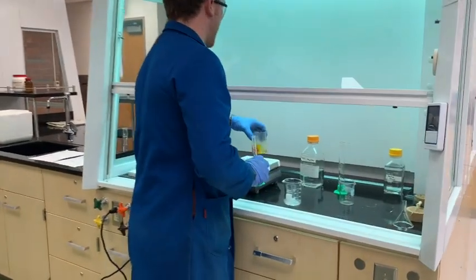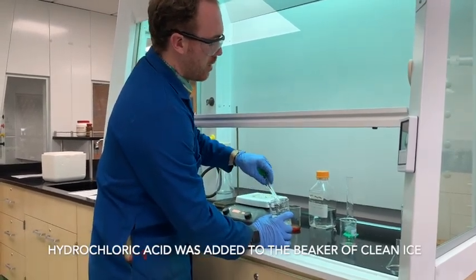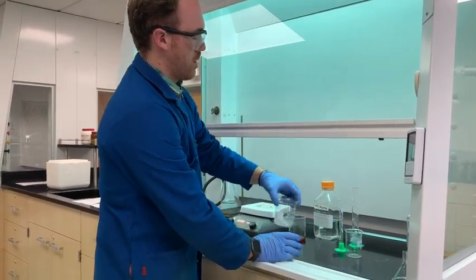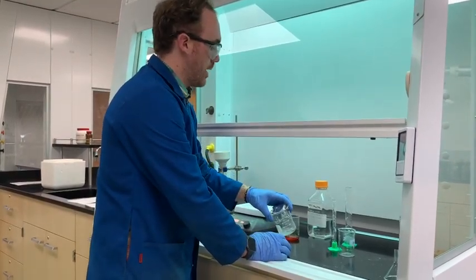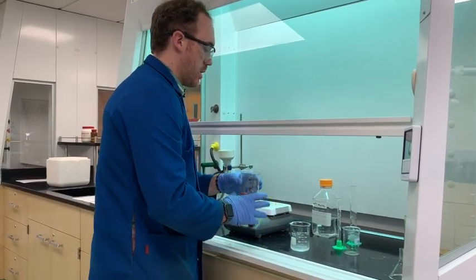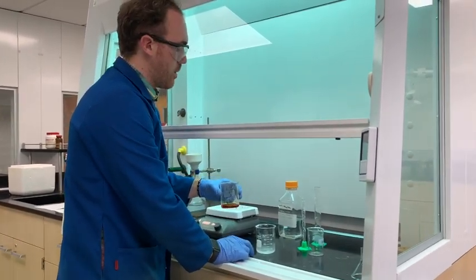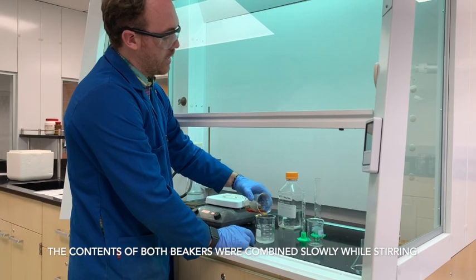All right, so now we're just going to take this hydrochloric acid and place it into this beaker with the ice, mix that around. Remember, you always want to add acid to solutions of water, and as soon as this ice hits this beaker, it starts to melt, so definitely don't do it the other way around. I think bad things can happen. So just good practice. Then we're going to take our mixture of the sulfanilic acid and the sodium nitrite, and we're going to throw that right into this, just adding a little bit at a time.